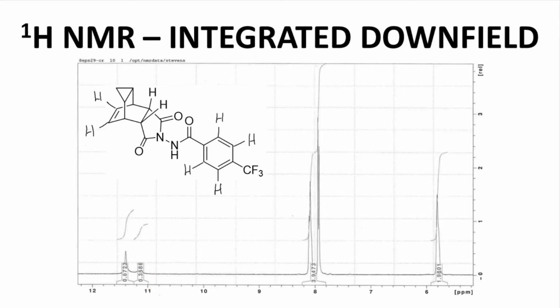What is happening here? Well, this compound, which is after all an active ingredient in a pharmaceutical drug, is a very well characterized compound and is known to exist as an equilibrium of 2 relatively stable conformational isomers. The isomers involve the rotation about the amide C-N bond. These isomers are called rotational isomers, which is sometimes shortened to rotamers.